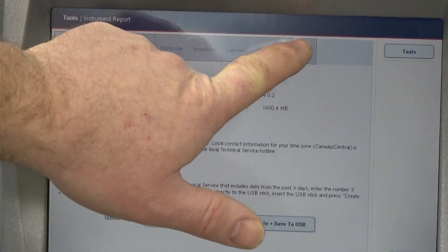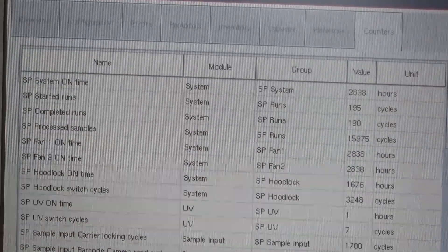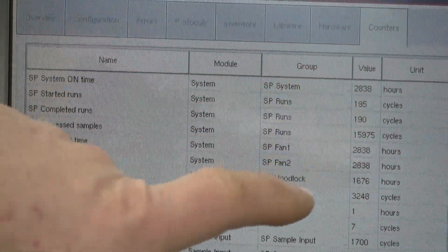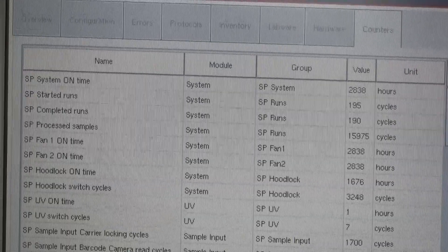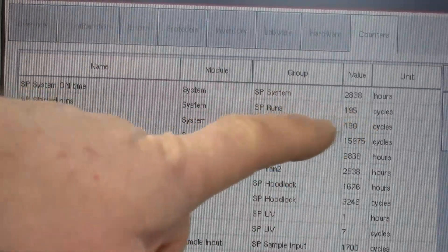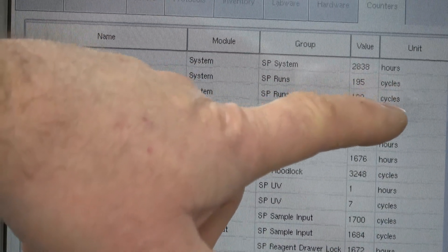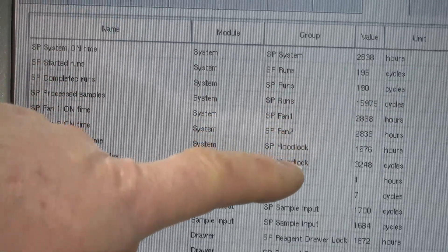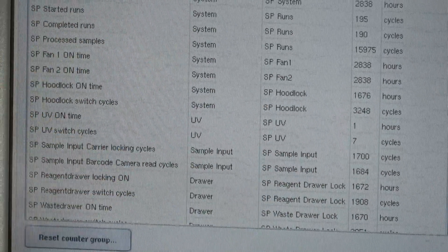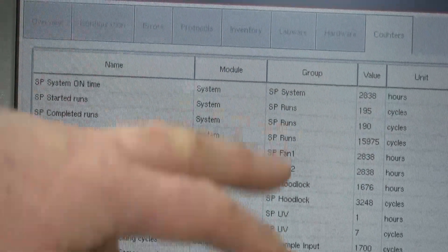At the end here there's a counters tab, and that's where we want to go. The total power-on hours — as far as how long the machine has been powered on — is 2,836 hours. That counts even when it's just powered on and not doing anything. If you look at the start runs, there are 195 actual cycles on this machine. There's a whole list of hours per different components, but essentially we're just looking at the total hours powered on and the total cycles.